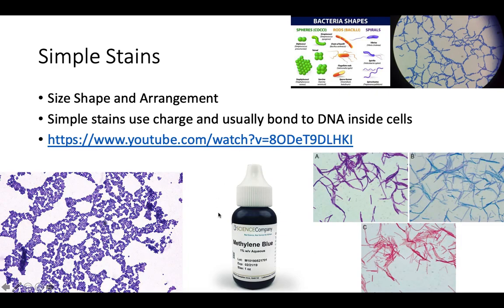Simple stains get their name because it just uses one stain, one dye, one liquid, one chemical. It is simple. It does not allow you to tell apart the gram reactions of the bacteria based on how their cell walls are put together. It does not allow you to see if they produce endospores. It doesn't allow you to see anything at all about the cellular makeup of this bacteria other than three things: how big they are, what shape they are, and what arrangement they're in.